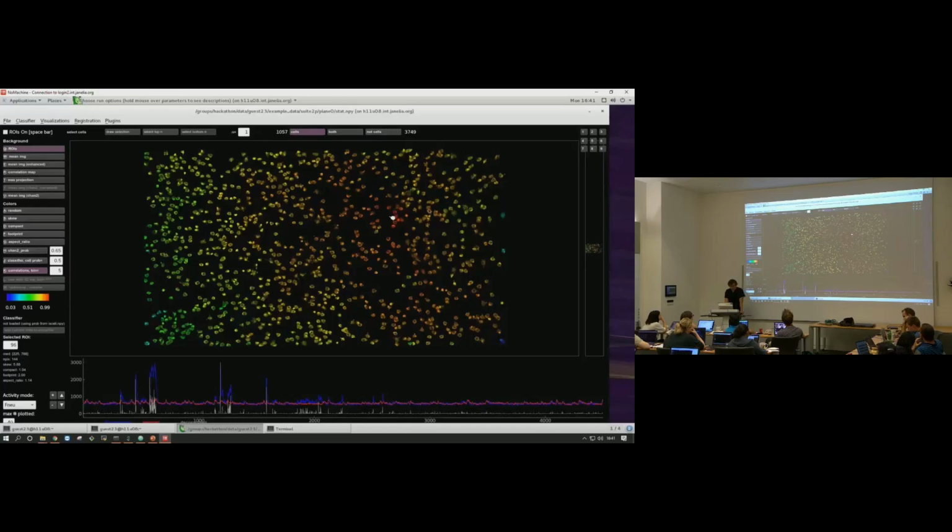So over a big area, we can see the neuropil is highly correlated, 0.99. Even yellow is a 0.8 correlation. Green on the edges here is a 0.5-ish correlation. So that's roughly the spatial decay of the correlation of the neuropil.